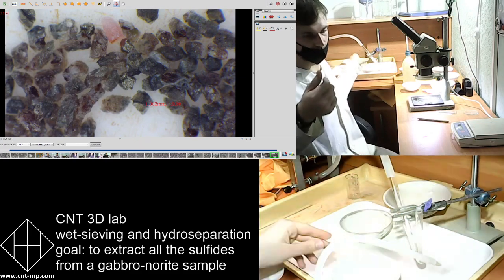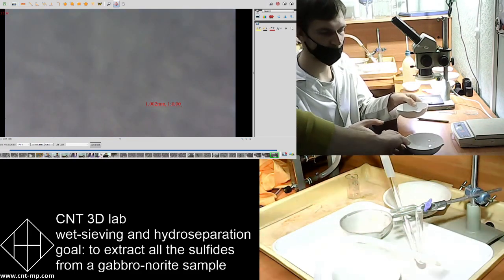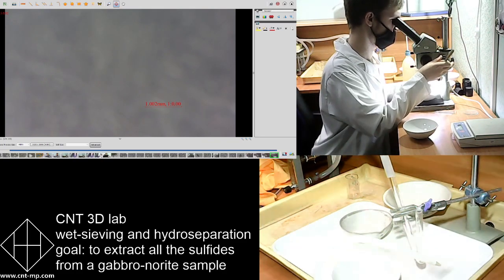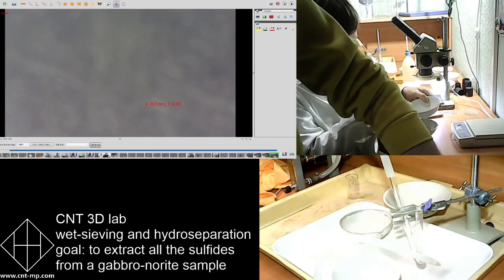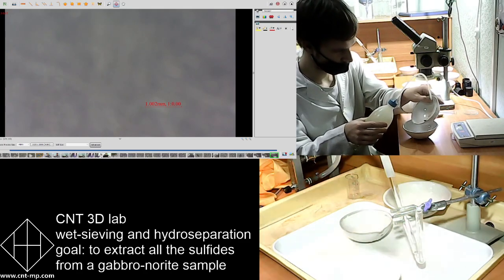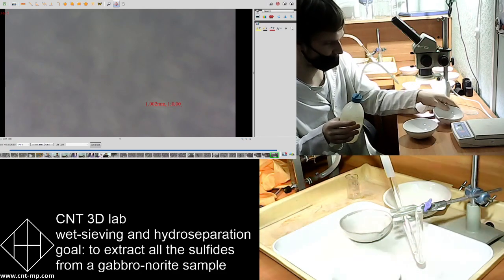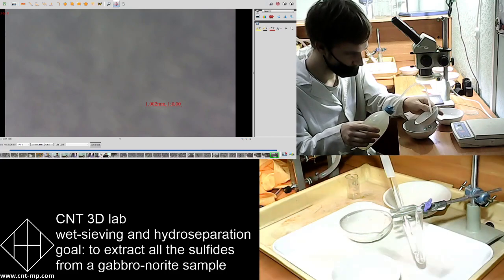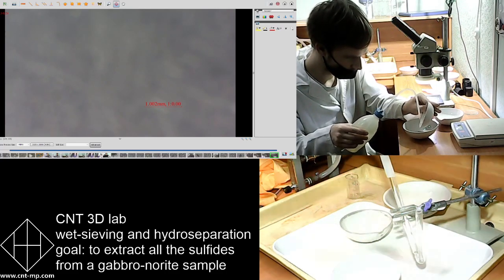And Urja is asking, how can you determine which fraction will have the desired minerals? Well, out of the experience, anything that is rare recovers at the very fine grained fraction. Okay, so it's very seldom that you can see coarse grains of the accessory recovery. Okay, it's usually in the very fine grain.